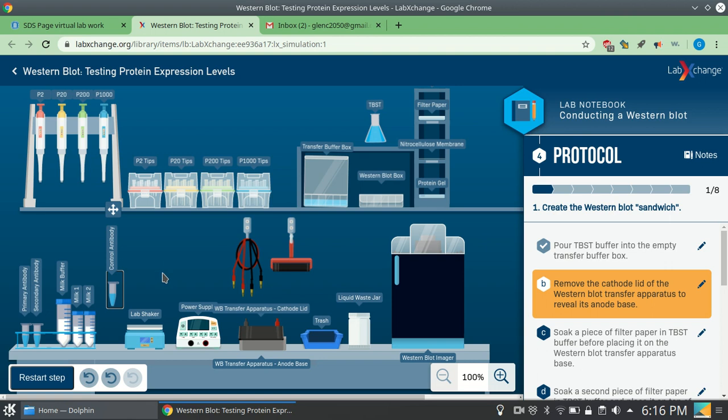So in order to prove that the technique itself worked, we used a control antibody to show that a protein that has not been edited is present and the Western blot does show it. So control antibody is just like primary antibody, except it is specific to some very common protein that we're not touching. Okay, so that's a nice hint for you here.